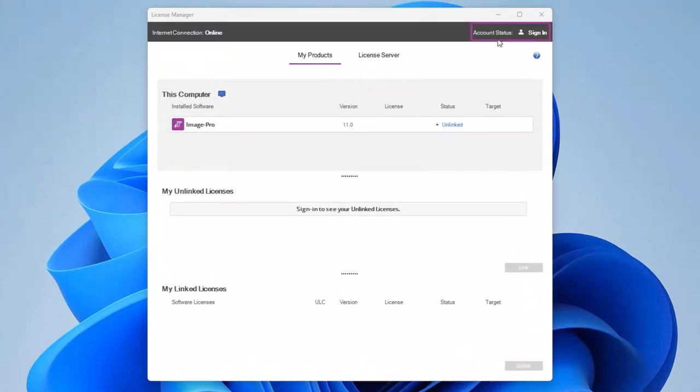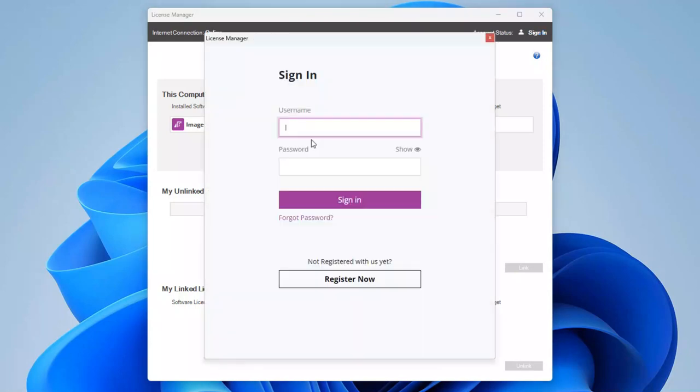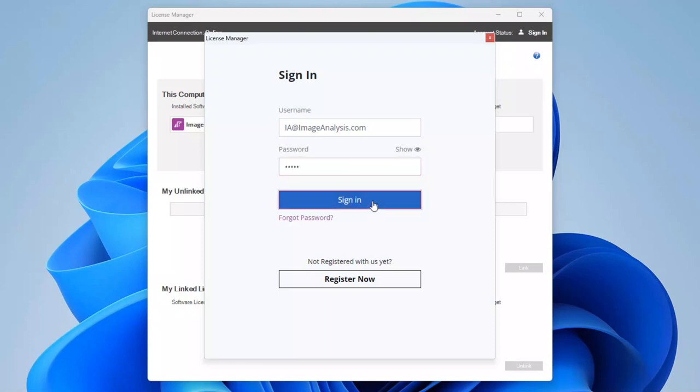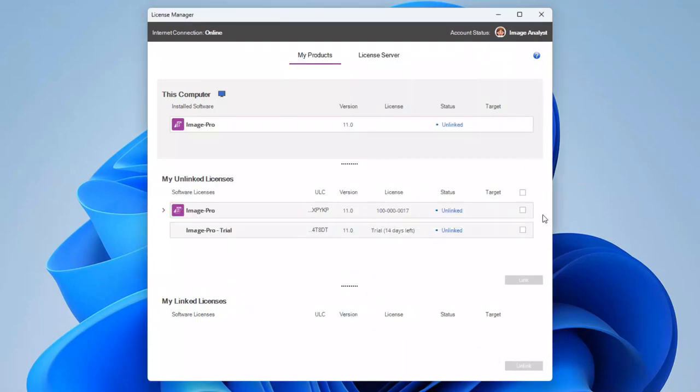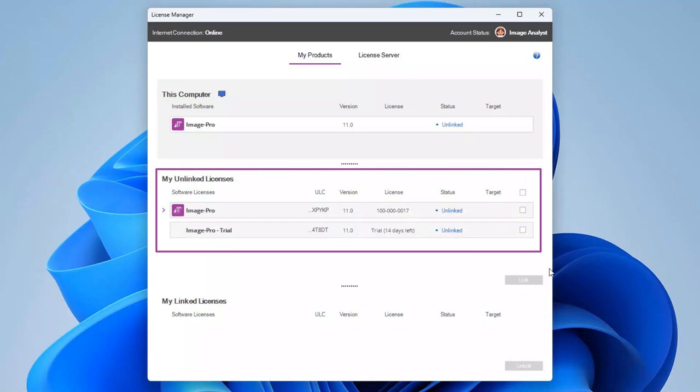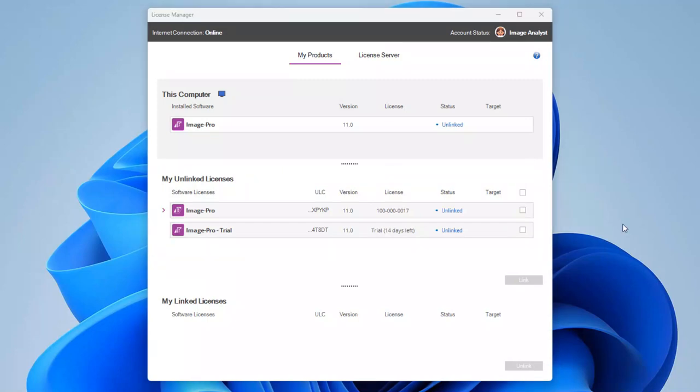Sign in to the License Manager using your My MediaCy username and password. Your license bundles are shown in the My Unlinked Licenses table. Select your bundle's checkbox and click on the Link button.